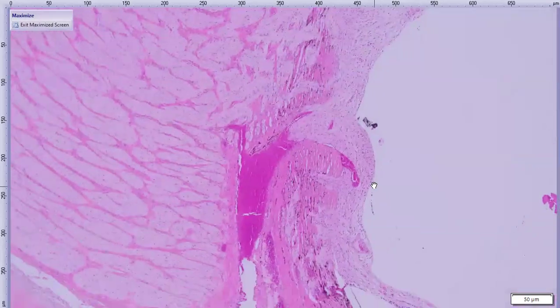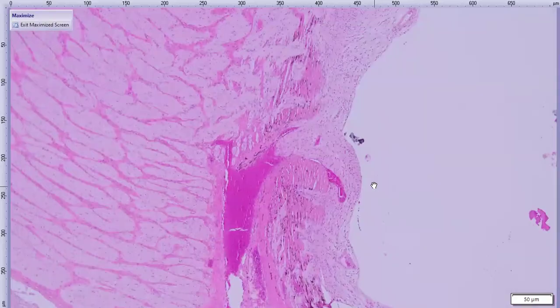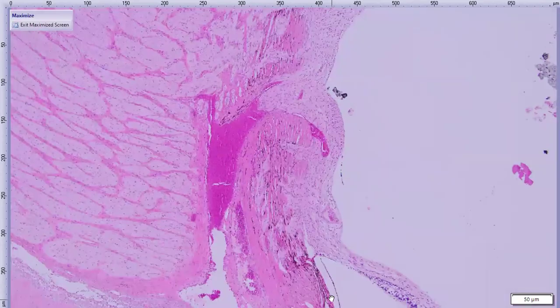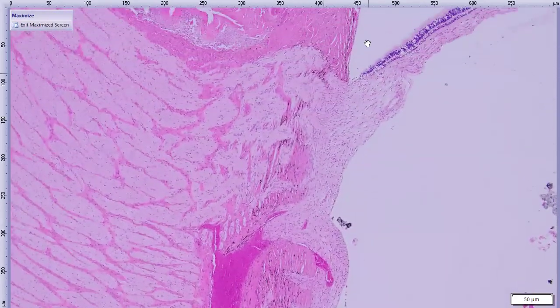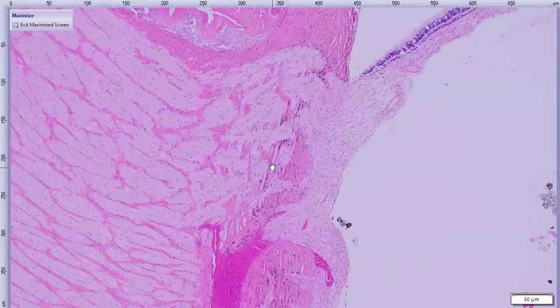And then evaluating the optic nerve and retina on the goat is a little bit trickier. You could maybe believe me when I say that usually in most species, if you draw a line straight across where the choroid is, and then all the way to the other side across an optic nerve, typically the beams of collagen of lamina cribrosa, this pink stuff here, should be level with that.